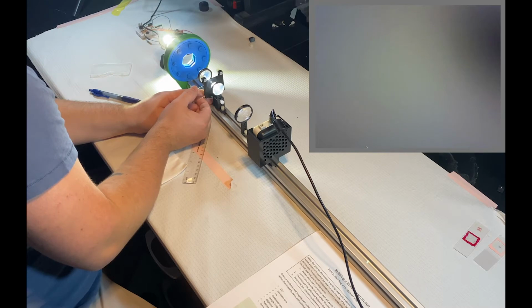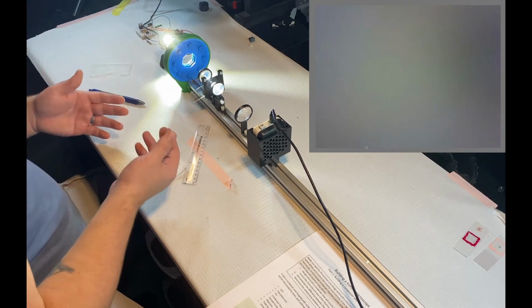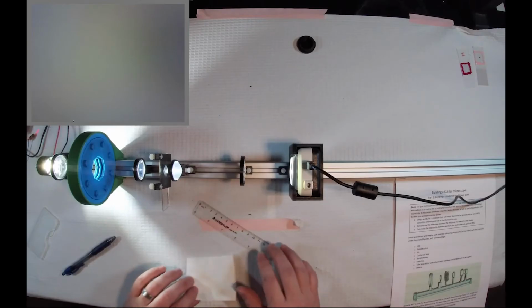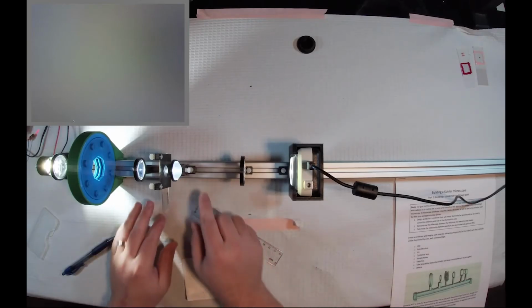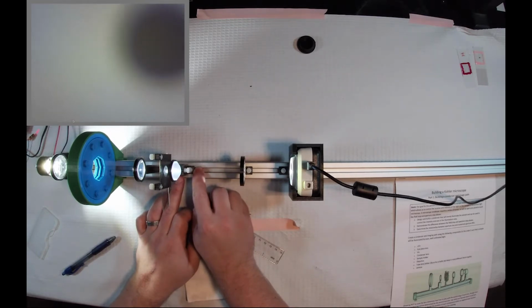So it looks like we've got a dot. Not going to worry too much about the positioning because obviously it's very out of focus. So, things that we can do to adjust. Well, it's probably mostly due to a misalignment of our objective lens. And I imagine that we need to get a little bit closer. So I'm just moving the objective lens a little bit closer to our sample until our dot comes into focus.